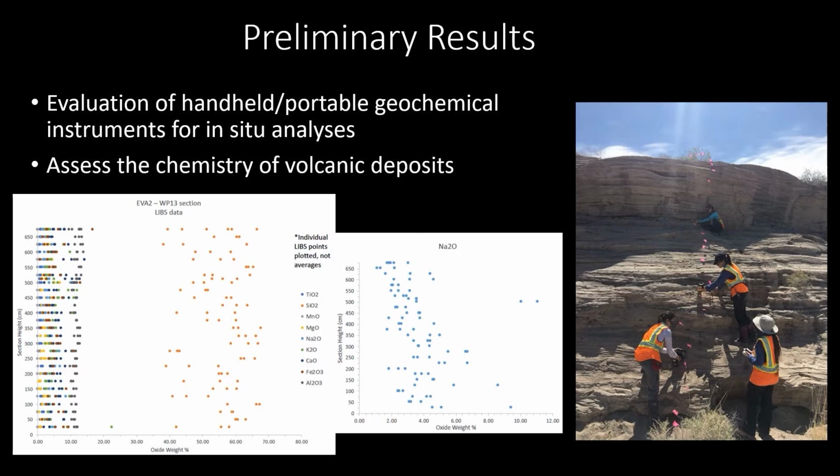But you can see there's quite a spread there. I pulled out sodium as a separate plot because perhaps there's a decreasing concentration trend as you go up section. But I know this needs to be looked at and thought about a little further. Overall, these plots give you an example of the sort of data and trending that are possible with these geochemical measurements.